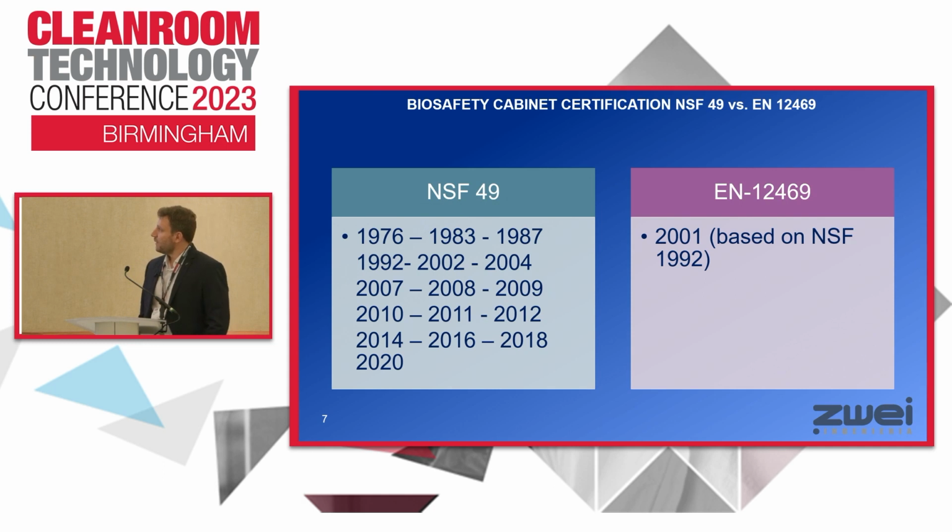Here, the update of NSF 49 and EN 12469. It's important to emphasize that when reading the 2001 EN, it is based on the text of 1992 of NSF 49.